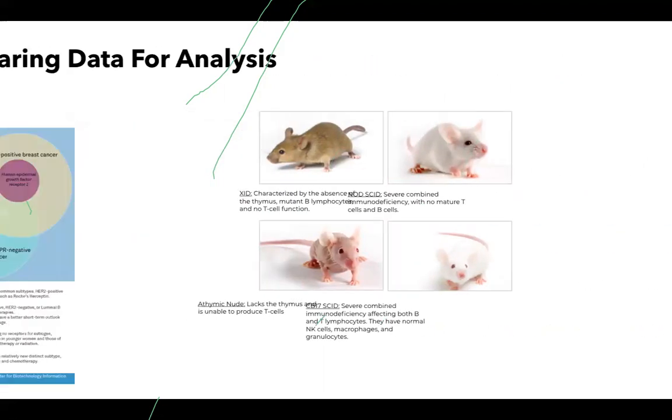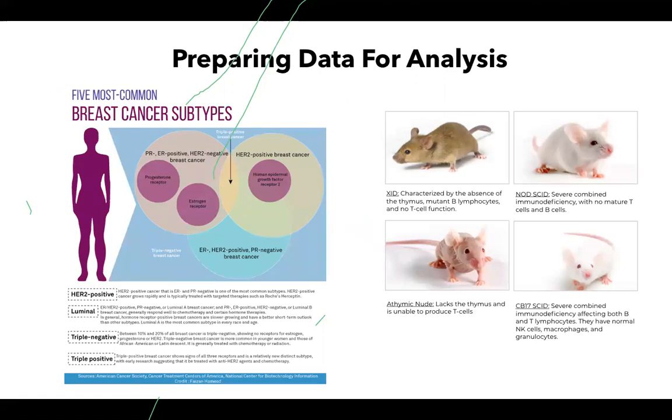So now we will go into our example, which we started working on for a while, about the types of breast cancers. In our example, we use the same data set that was used for differential expression. The breast cancer samples were obtained from PDX models. These PDX models are immunocompromised mice with breast cancer xenografts. So different types of breast cancers were implanted into these mice.